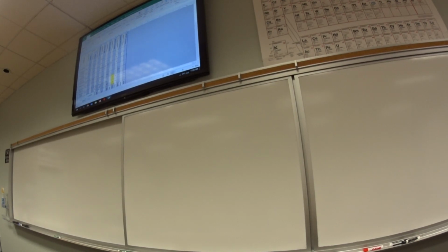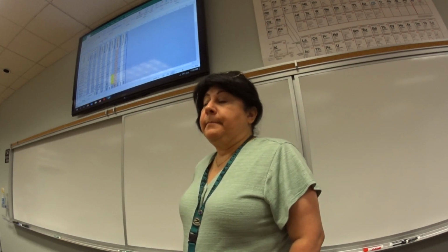So look at the gram-negative rods. Looking at catalase, is it a good test for a person who has a gram-negative rod to do catalase? Does it give you any information? No. So don't even go near it. If something happens and that catalase is wrong, you're not getting the right result, all it's going to do is drive you nuts.